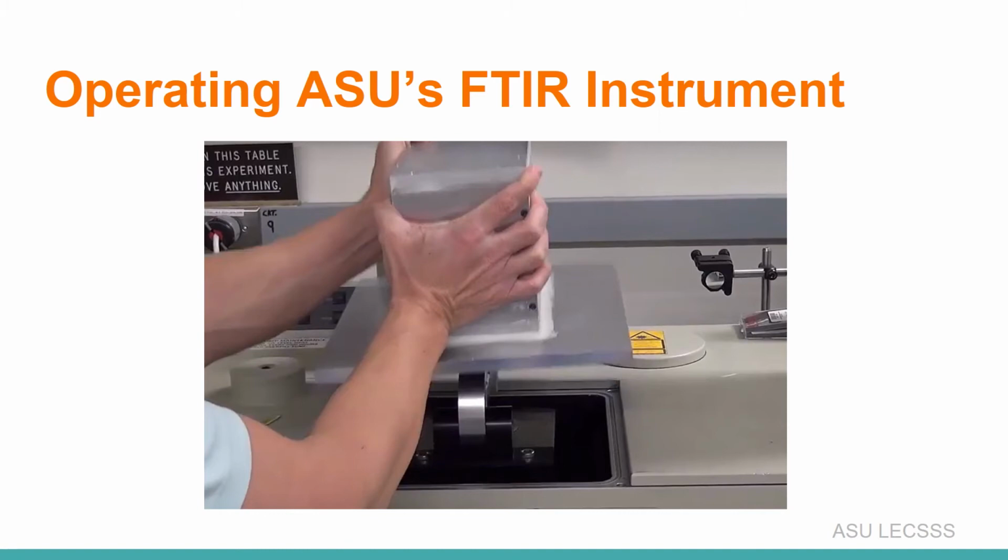You then lift the knob closest to you and gently lift the arm towards you, and then clean and wipe down the surface with a chem wipe. And then you can put the knob back and push down the knob, which is nearest to you, and tighten it, but not too tight, kind of like a cozy fireplace tight. Make sure the top is not touching the diamond, and place the lid back down and evacuate your system by pushing the up arrow and then enter to get a blank run.